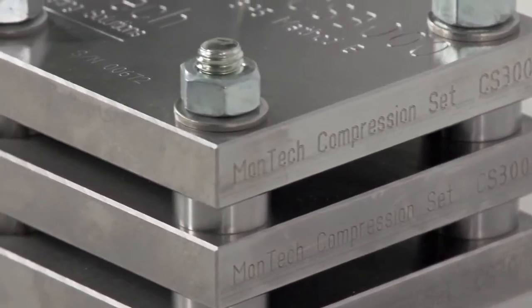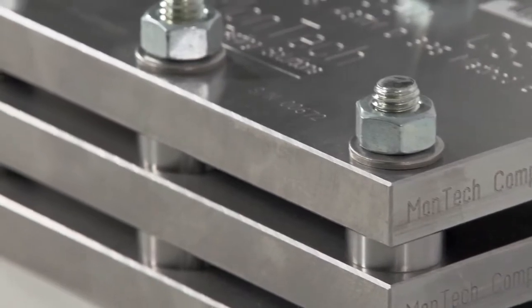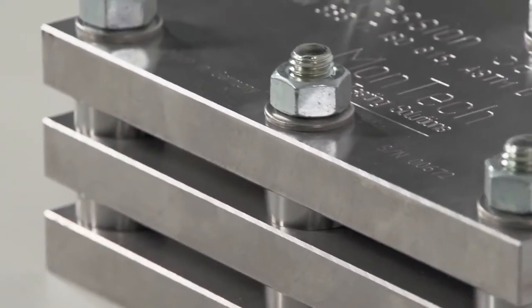It is made of precision ground stainless steel featuring stiff compression plates and spacers of a height determined by the customer's needs.